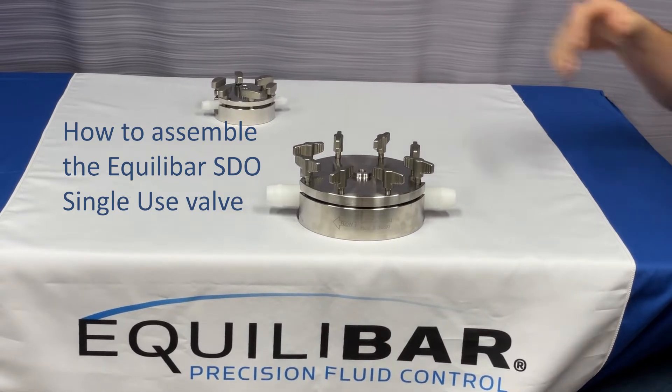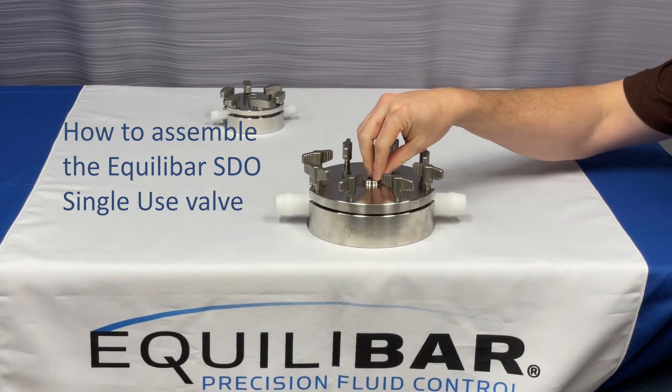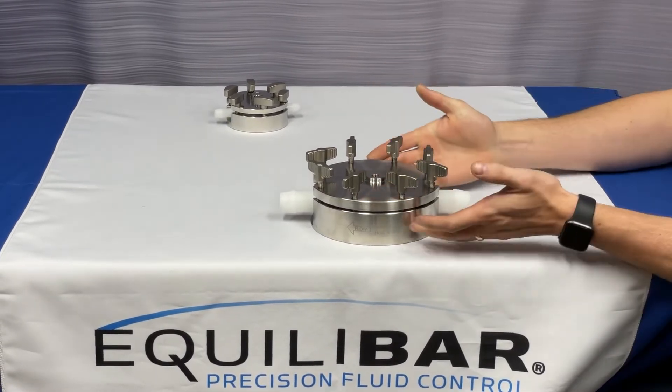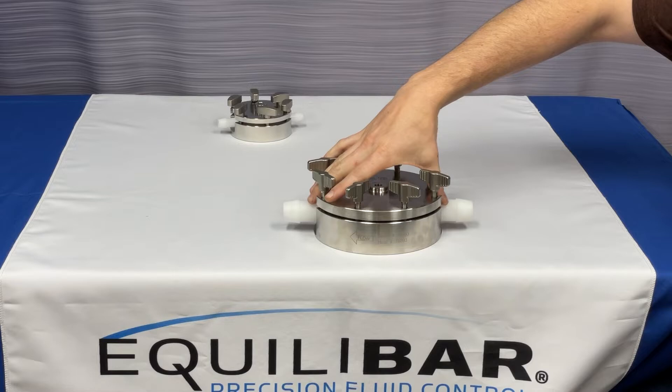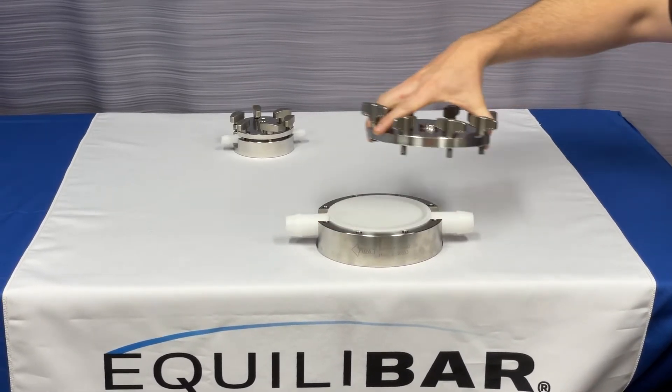Hi, my name is Ryan Hefter, and today we are going to discuss how to disassemble and assemble an Equilibar single-use back pressure regulator. This is our SD08 one-inch valve, and to disassemble, I will first untighten our wing screws and then remove the reference cap.